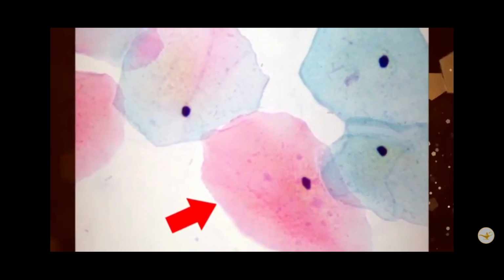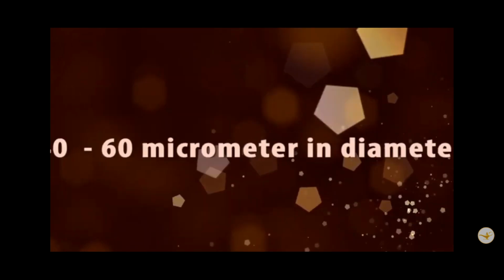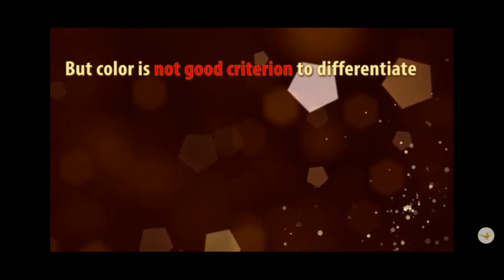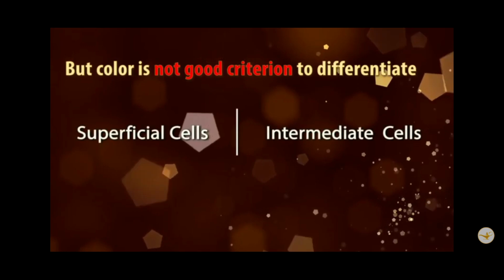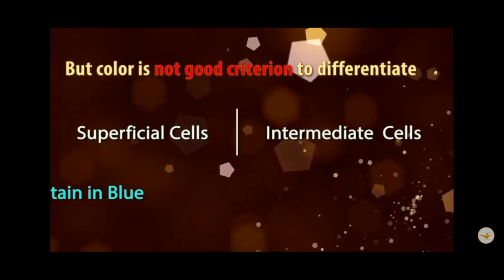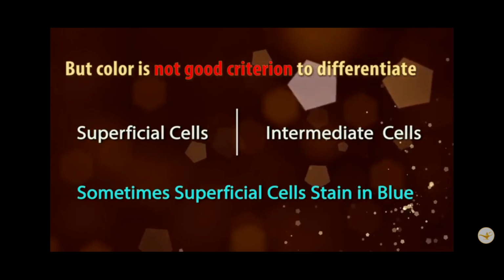Kindly write this down. Mature superficial cells, class, are polygonal squamous cells measuring 45 to 50 micra in diameter and are usually identified by the presence of pale pink staining cytoplasm and dark pycnotic nucleus. True acidophilia is characteristic of superficial vaginal cells under estrogen influence. But this is not, however, a reliable index of maturation, okay? So when you see predominant mature superficial cells, that means that this woman has an increase in estrogen.